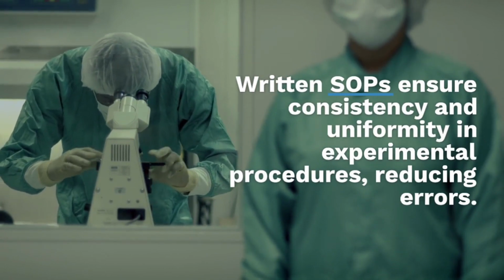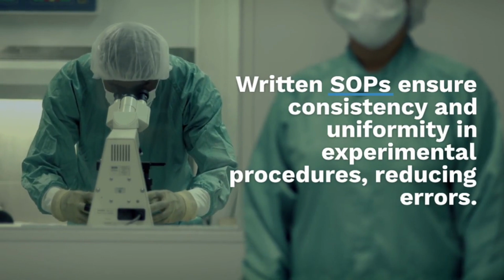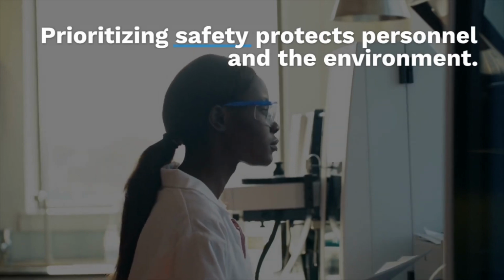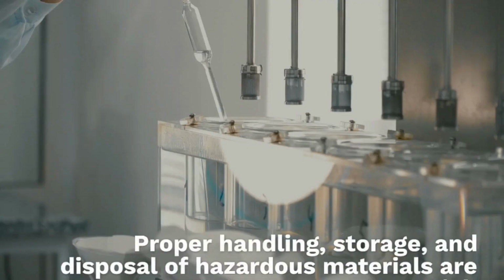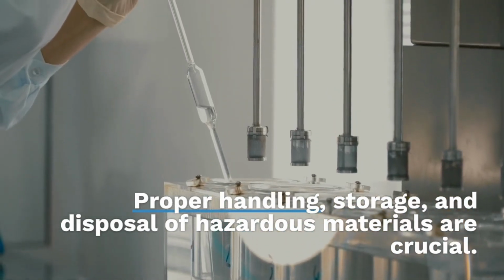3. Safety precautions. Laboratories must prioritize safety to protect personnel and the environment. This includes wearing appropriate personal protective equipment, PPE, such as lab coats, gloves, safety goggles, and respiratory protection when necessary. Proper handling, storage, and disposal of hazardous chemicals and biological materials are also crucial.